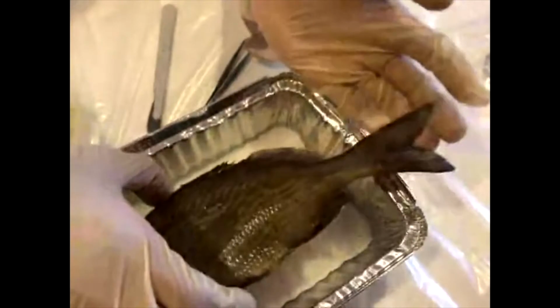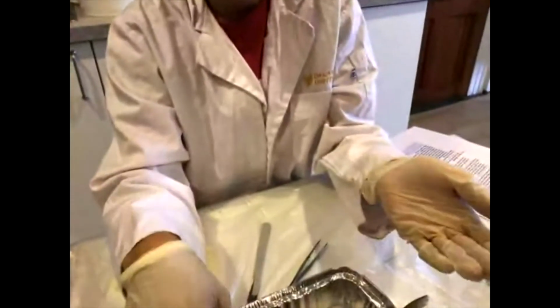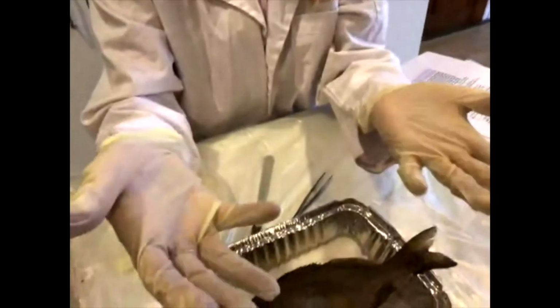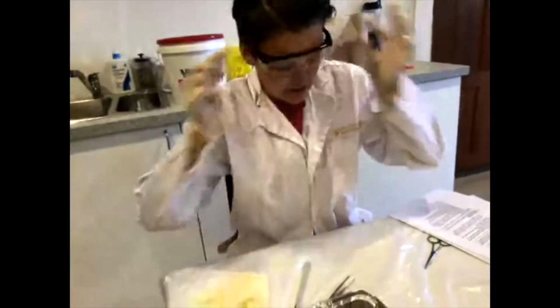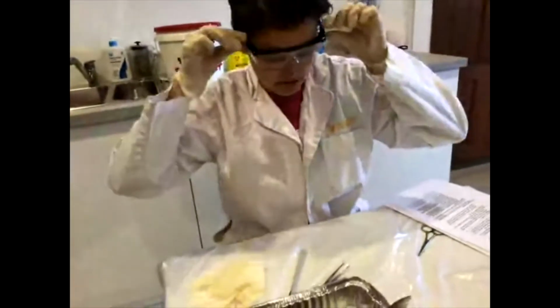Now, before I dive into anything, I have gloves on, one of the most important pieces of safety gear that you wear in a dissection, mostly because the fish is preserved with chemicals that I don't want to get on my own skin. I'm also going to put on some goggles just to protect my eyes from the same chemicals. And I've got a lab coat on, so we should be set.